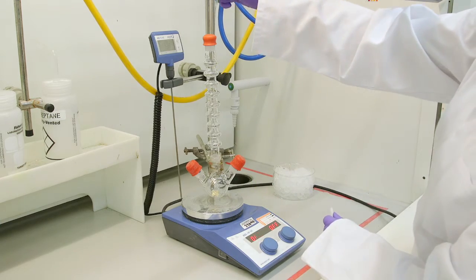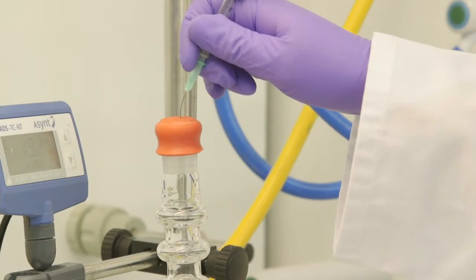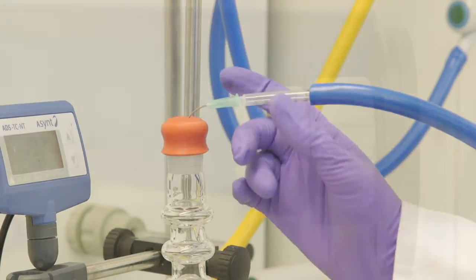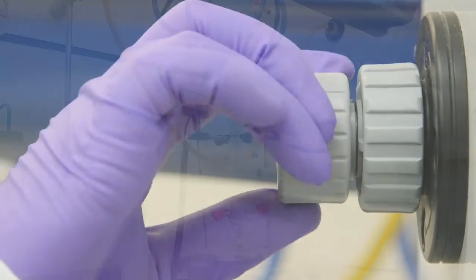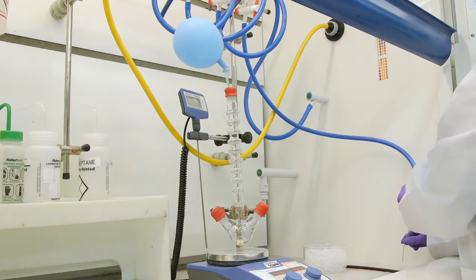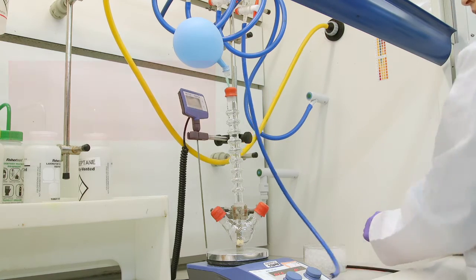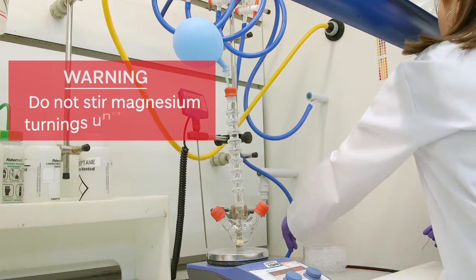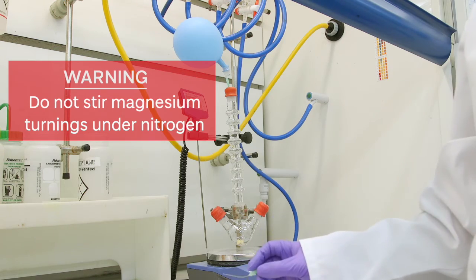Now we will evacuate the air from the flask by attaching a vacuum line to the flask. We will then use our nitrogen balloon to create the nitrogen atmosphere. Remember it is important not to be stirring the magnesium turnings under nitrogen.